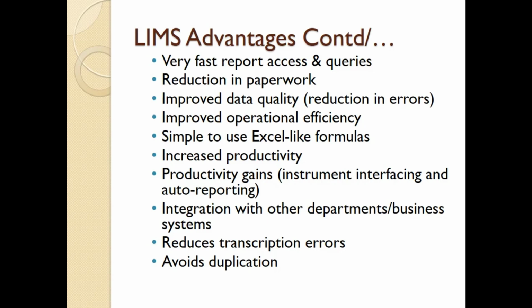More advantages include things like very fast report access and queries, reduction in paperwork, improved data quality, so reduction in errors or transcription errors, improved operational efficiencies, simple to use Excel-like formulas, increased productivity, productivity gains, so instrument interfacing and auto reporting, integration with other departments or other business systems, reduces transcription errors and avoids duplication of work.